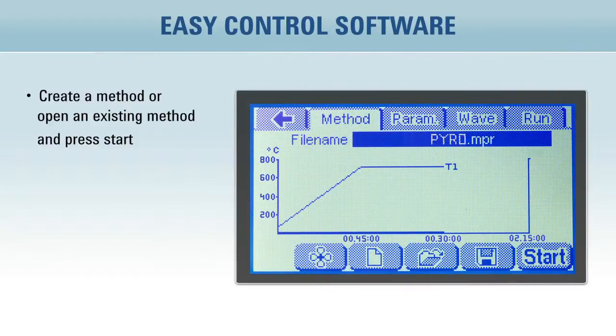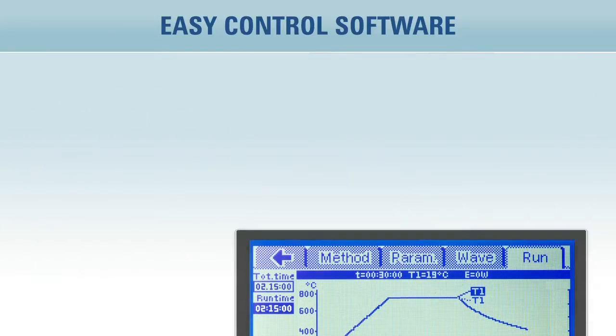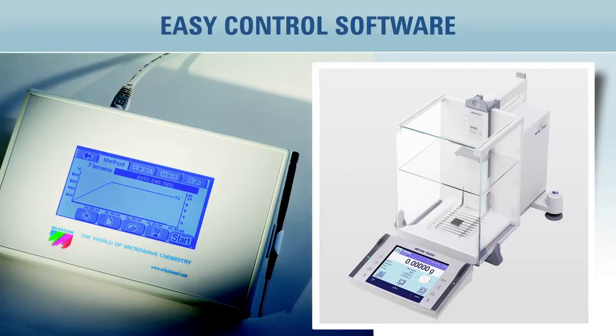Create a new method or open an existing method and simply press start. When the microwave program is in progress, a real-time display of the temperature and the applied microwave power is shown. When the run is finished, it is stored and can be recalled at any other time. You can also connect a balance to the controller to transfer the weights and store them with the run.